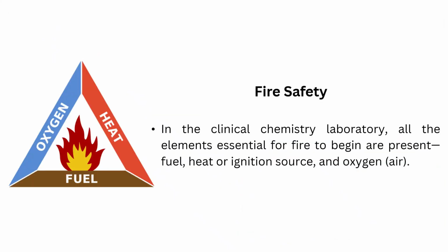Next would be fire safety. Remember, class, fire is basically a chemical reaction that involves the rapid oxidation of a combustible material or fuel with the subsequent liberation of heat and light. In the clinical chemistry laboratory, all the elements essential for fire to begin are present. So that's fuel, heat or the ignition source, and oxygen or the air.